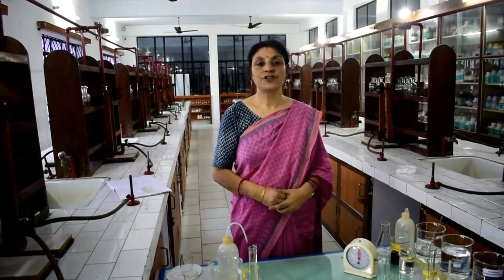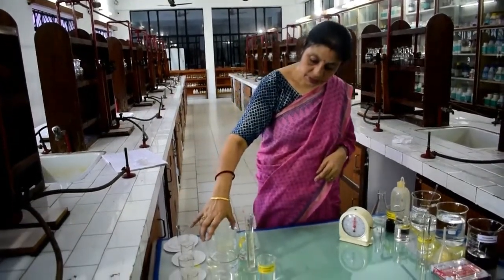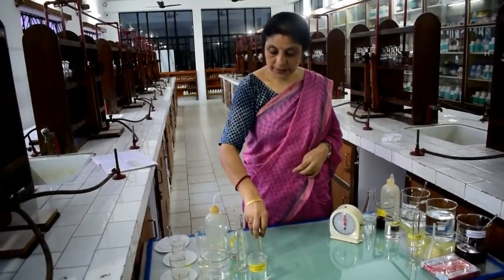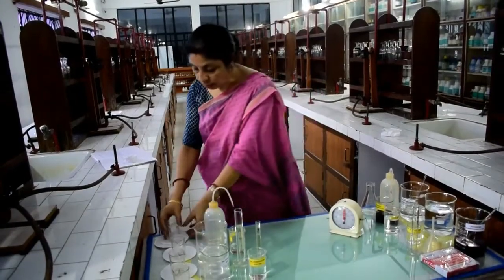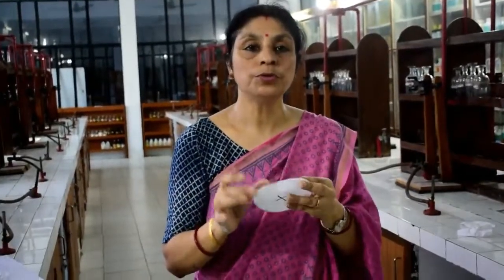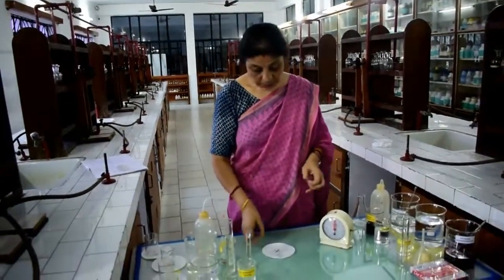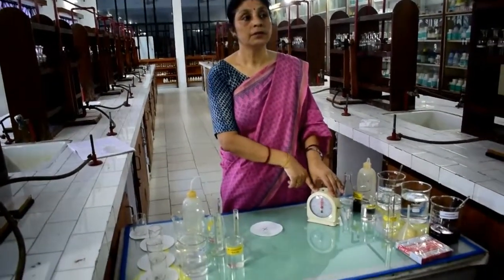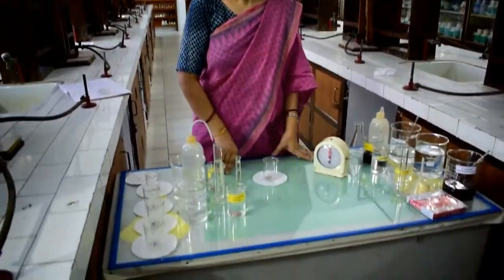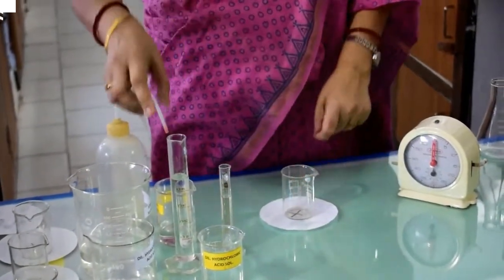Now let's start with the experiment. To carry out this experiment, I have sodium thiosulfate solution, HCl solution, and two measuring cylinders, one of 50 cc and the other of 10 cc. Now I have one X mark on which I am going to keep the sodium thiosulfate solution, and the time taken will be measured with the stopwatch. Now from the top, when I start viewing, the moment colloidal sulfur is formed, this X mark will disappear. So this is the experiment, let's start it.